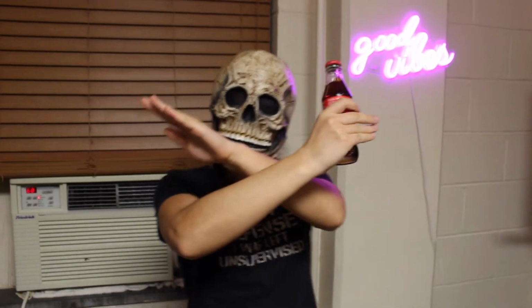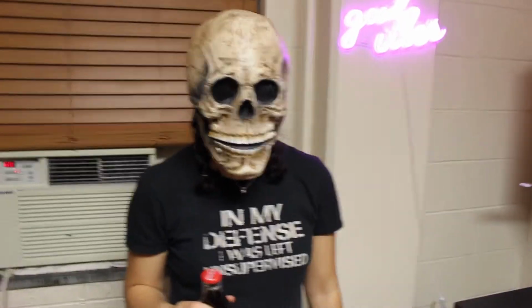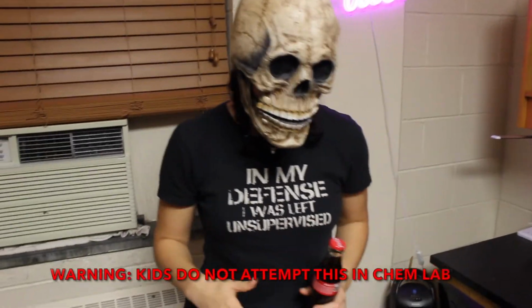I would never do such a thing. My eyes are so precious. I'll never look at the sun or the light with a spectroscope. Never, ever. Really, there's just no reason.